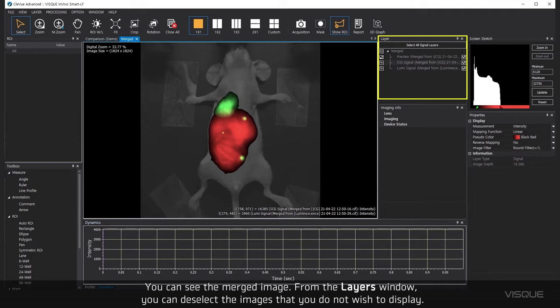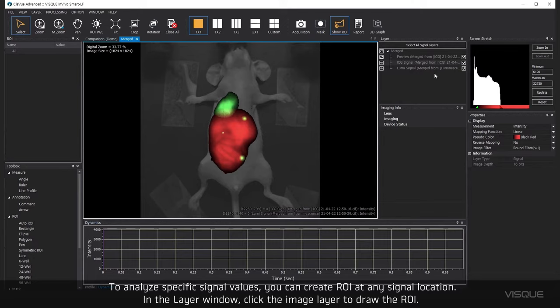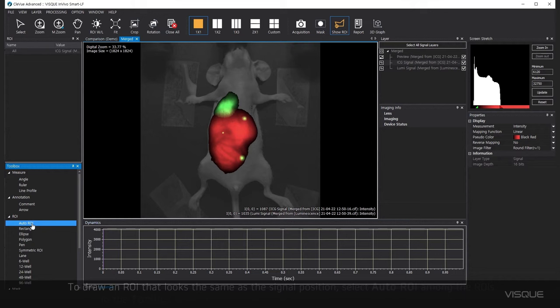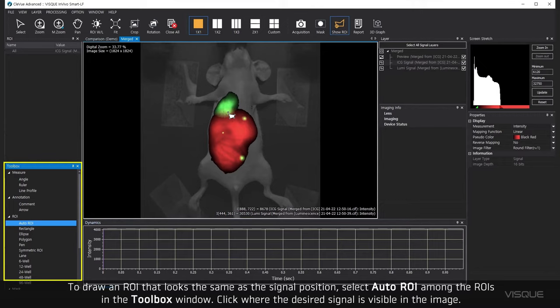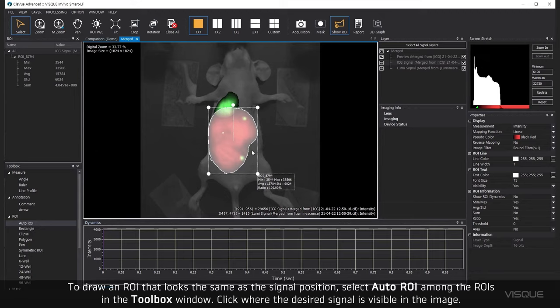To analyze specific signal values, you can create ROI at any signal location. In the Layer window, click the Image layer to draw the ROI. To draw an ROI that looks the same as the signal position, select Auto ROI among the ROIs in the Toolbox window. Click where the desired signal is visible in the image.